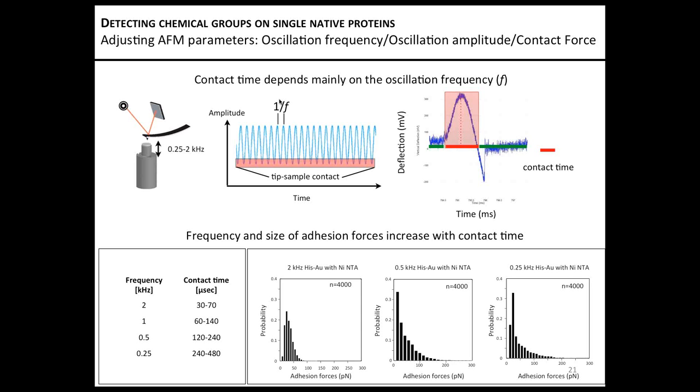Very interesting question we have here. What would be the limit in frequency that would still yield sufficient interaction between ligand and receptor? And that's, I think, quite relevant to your slide, Moritz, which is open right now.